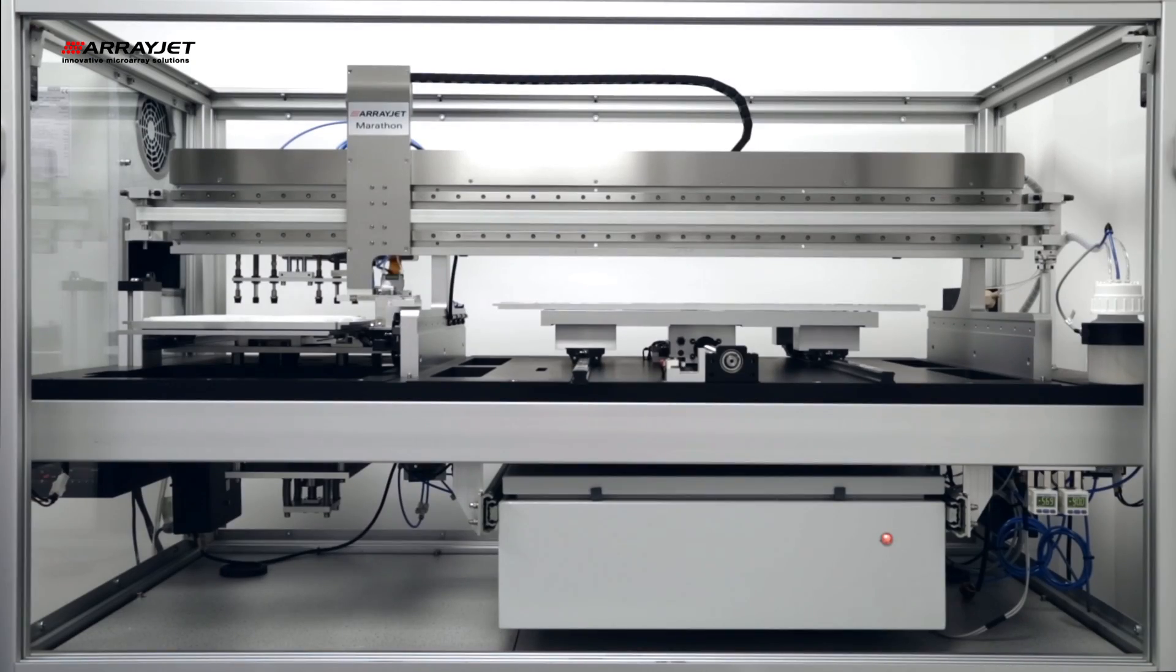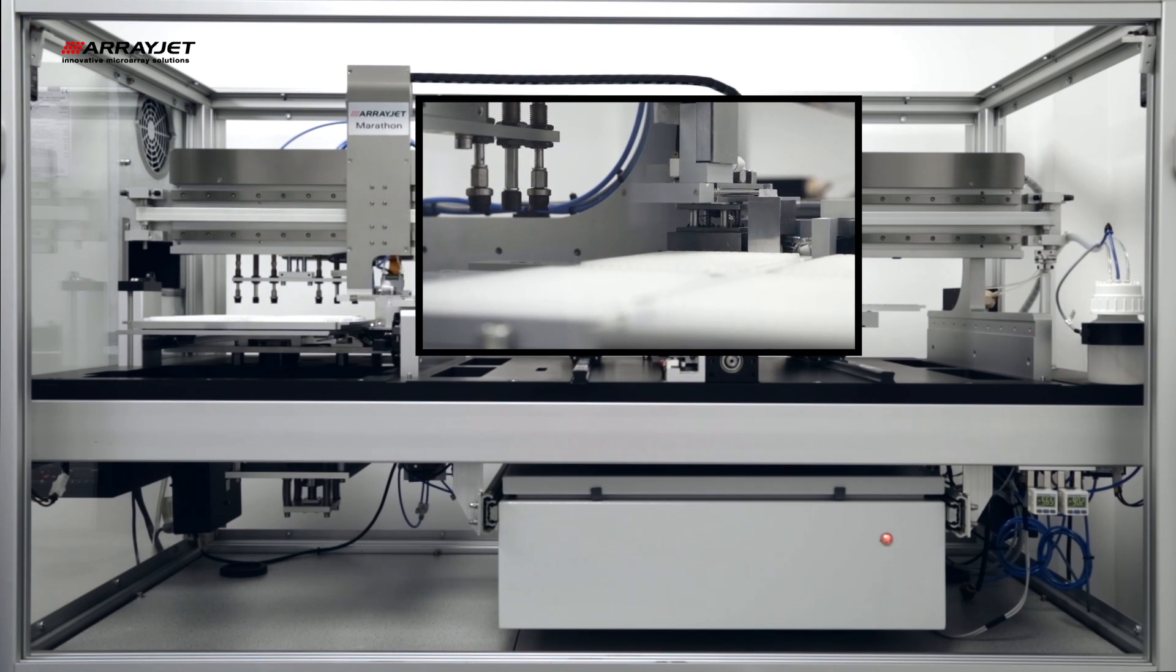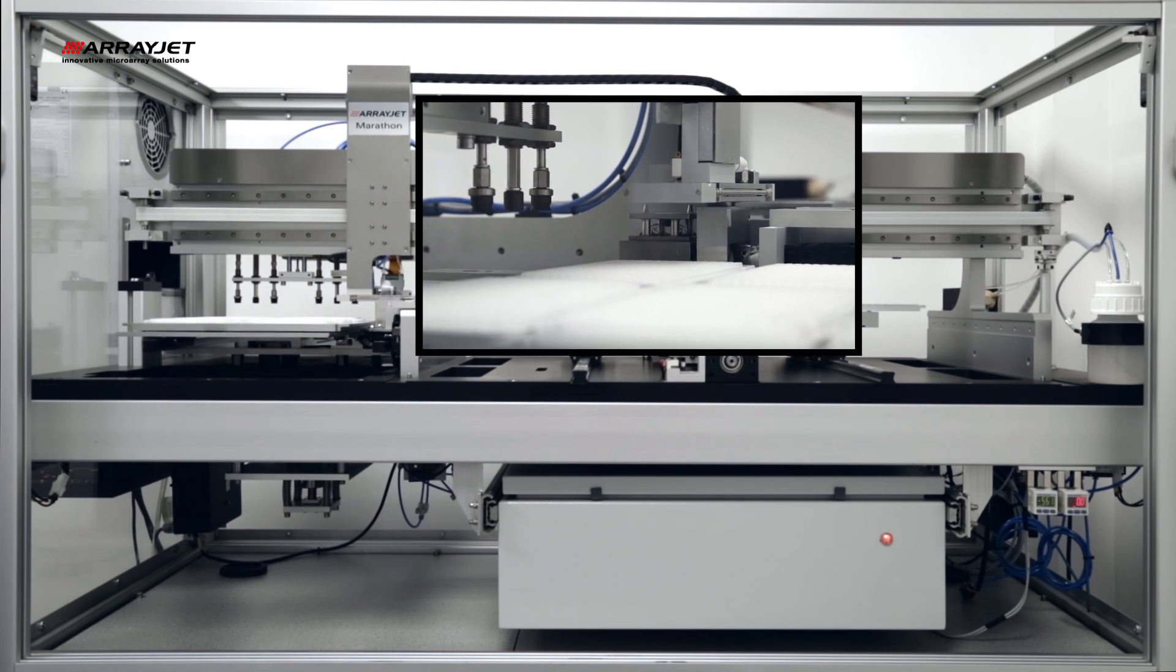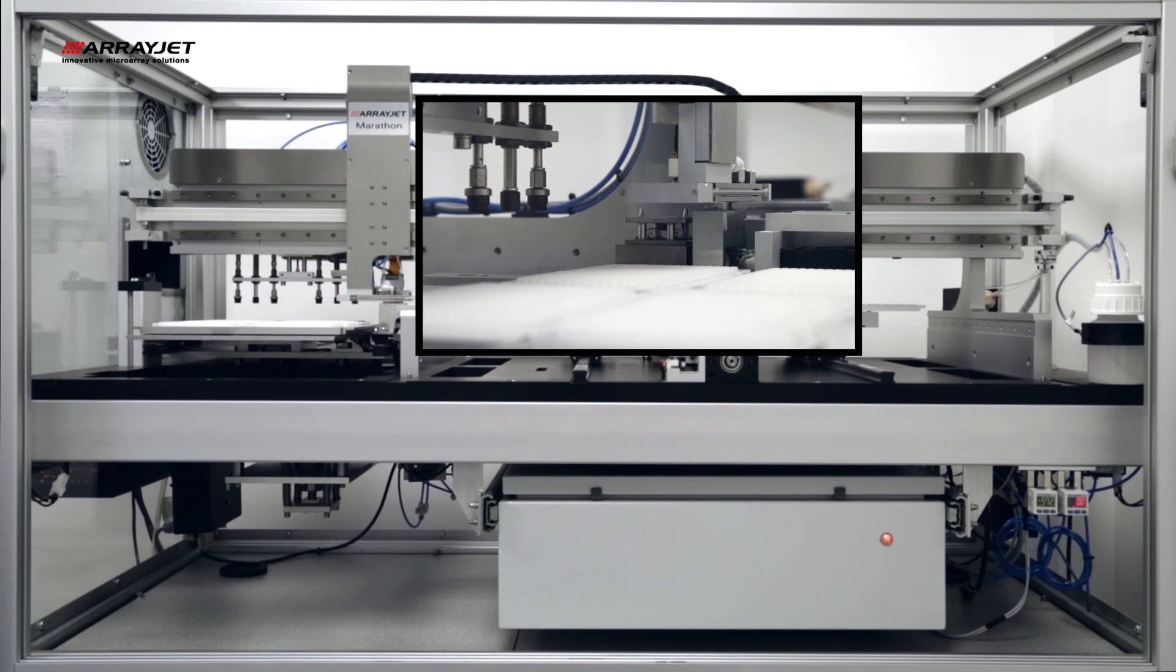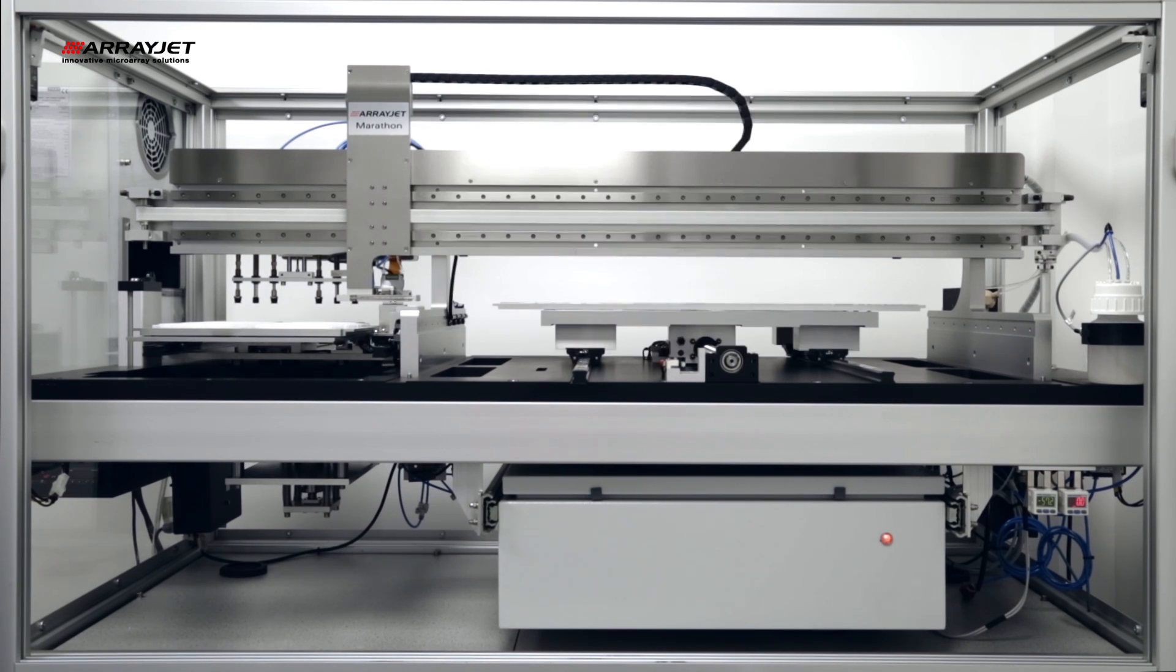After printing each set of probes, the printhead and jet spider undergo comprehensive and validated wash processes to eliminate cross-contamination.